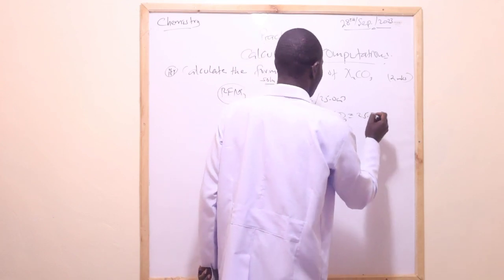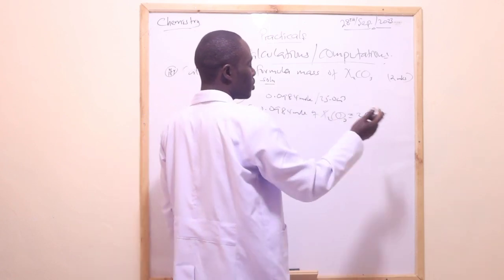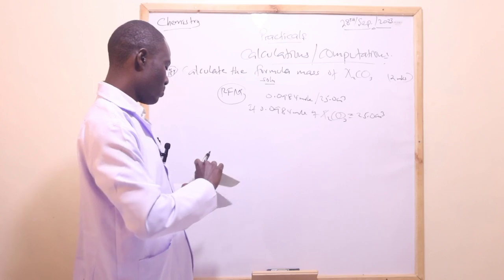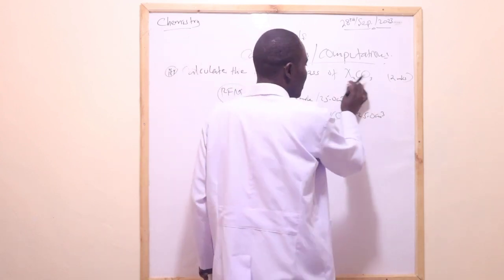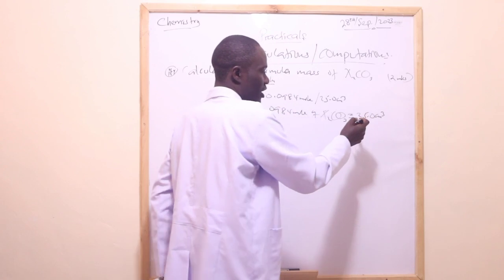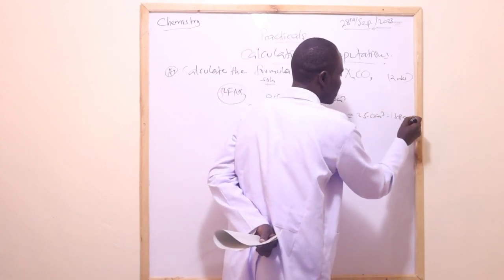25.0 cubic centimeters. And this should also be equal to the mass of that particular solute, because from the procedure, you're given the mass of that solute in solution BA21 as 13.8.